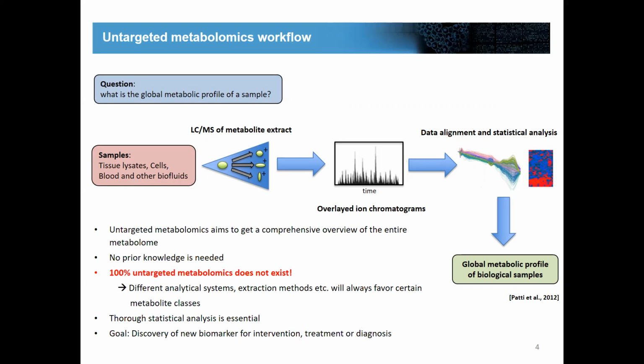No real prior knowledge about your samples or which analytes you want to analyze is needed, but I also want to point out that there is no real 100% untargeted metabolomics possible. There are always different analytical systems or extraction methods that will favor or disfavor certain metabolite classes.